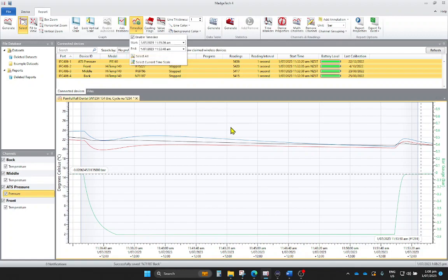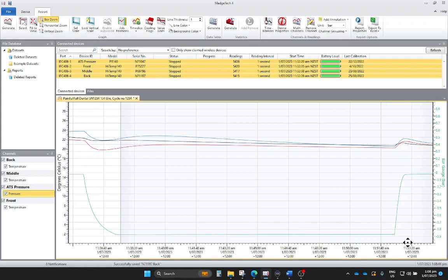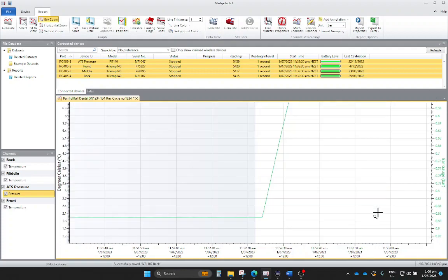Cool. Okay, so the time slice is now in here. So what I can do is just get this so that we have the two arrows. We want to move that till we're just on the start point there. And I often will just box zoom, so this is where we've got to make sure that we select from outside over. And now I can just move that to align up.